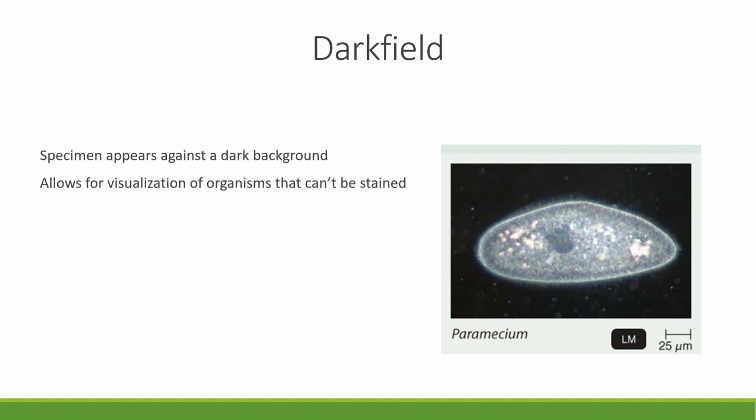Here's an example of a dark field microscopy image of a paramecium. If we take a look at the scale bar here, we will see that it has a length of about 25 micrometers in the scale. So this is probably about 6 to 9 times that scale bar. This would confirm about the right size of a paramecium of about 200 micrometers.